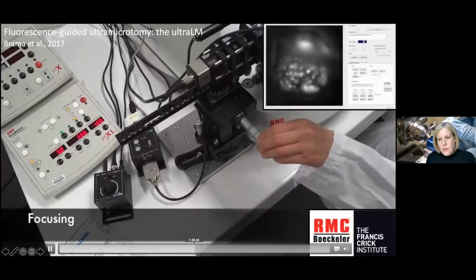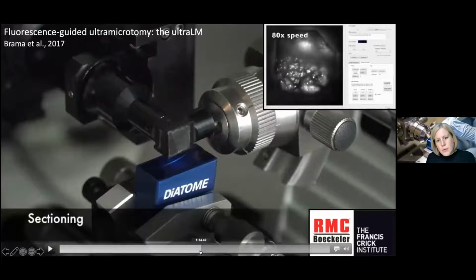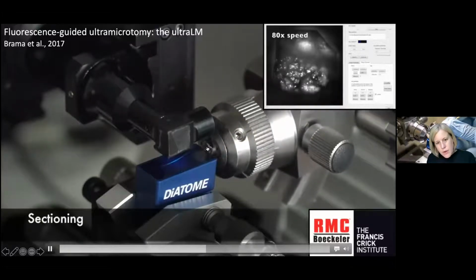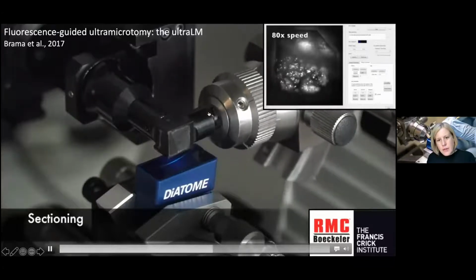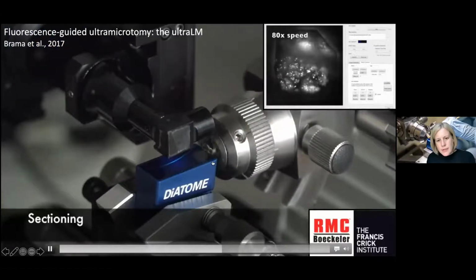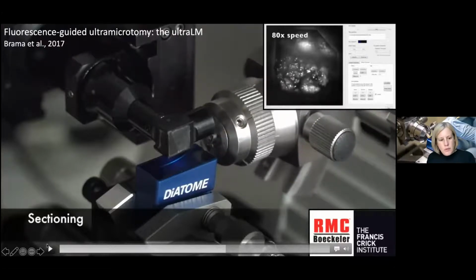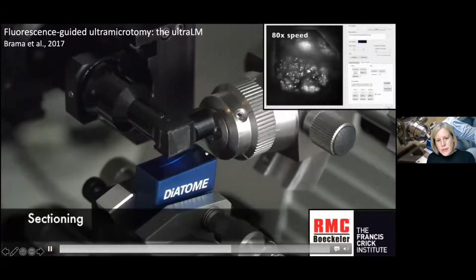And then once the run is started, the sample lines up with the microscope, then it passes down over the diamond knife, cuts a section, comes back up and over on its return, and then you can see the flash of fluorescence images taken. Again, you take a section, the sample comes up and over. There's a flash when the image is taken, and then it comes down.